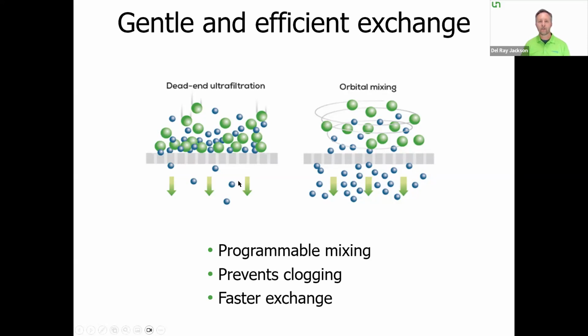As you can see on the slide on the left, we avoid dead-end ultrafiltration. We keep your biomolecules of interest in solution in the retentate and away from that membrane material to avoid any sort of aggregation that can occur.